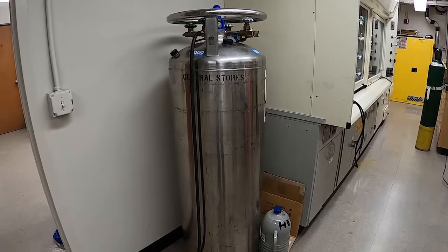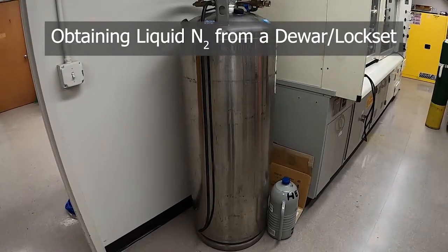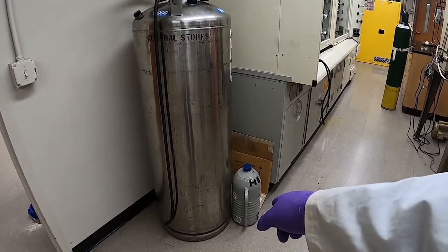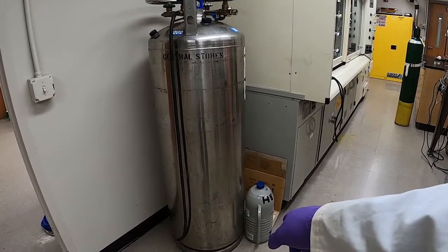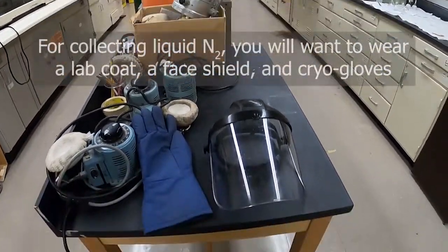But that means we have to highlight how to get liquid nitrogen. So this is our nitrogen tank. It's called a dewar or a lockset. And then we're going to use that small handheld dewar on the floor. We're going to get some liquid nitrogen into that and then have that on hand to make our cold bath with. But we need some PPE when dealing with liquid nitrogen.